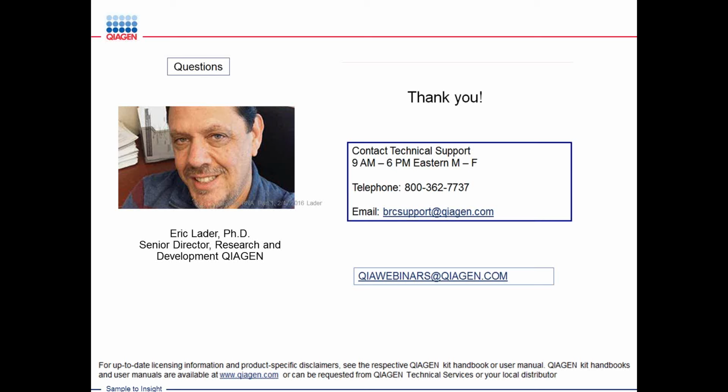You can use a software such as NormFinder. NormFinder will suggest something from the panel. It's a question that people have been asking for 30 years. We picked some genes that won't use up much of your read budget, and we put them on the panel as a service. If you're designing your own panel, you're welcome to add them or add anything you like. So it's hard to say, right? And not everything will suit everyone. But for the panels that we sell, most likely normalizing against tags is the reasonable way to do it.